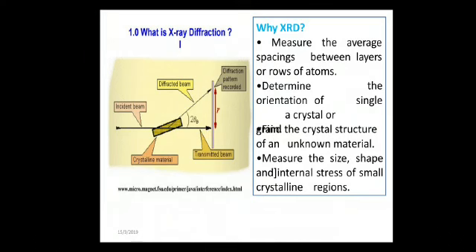Analyzing films, such as those having a thickness of 50 angstroms, for textures and phase behaviors. And also it is used to determine the crystalline minority phase, and also to determine the percentage of metal in crystalline forms and amorphous layers.